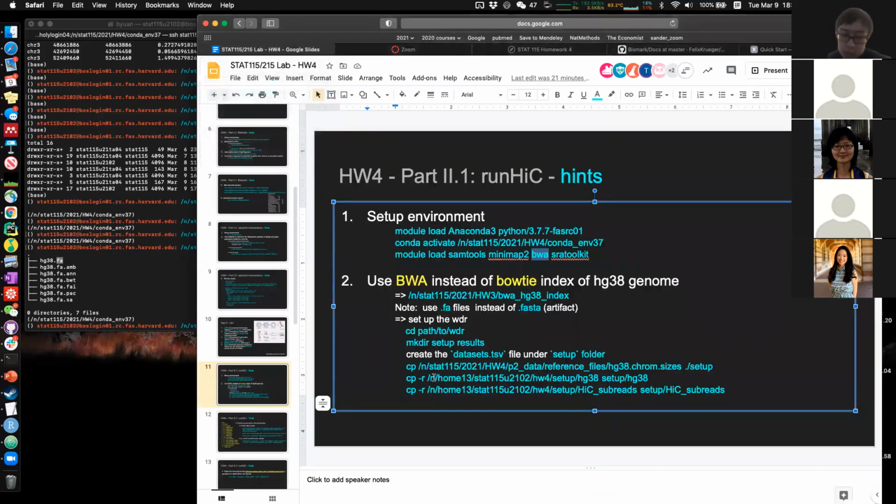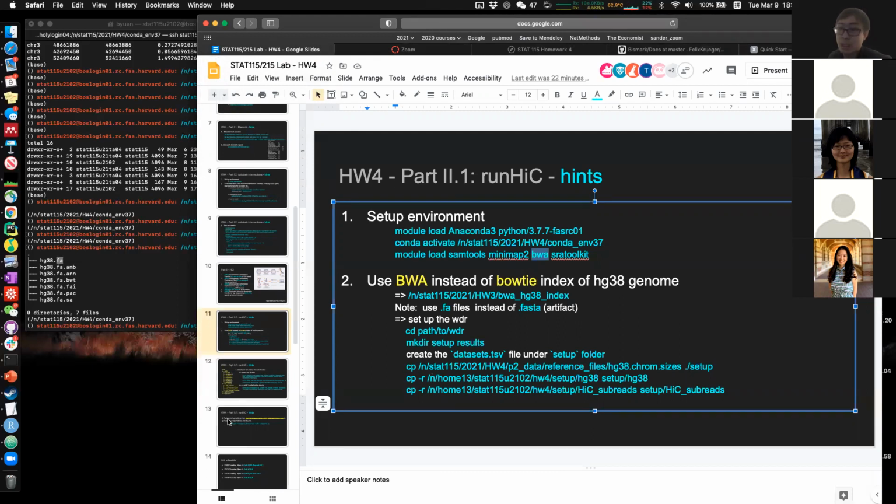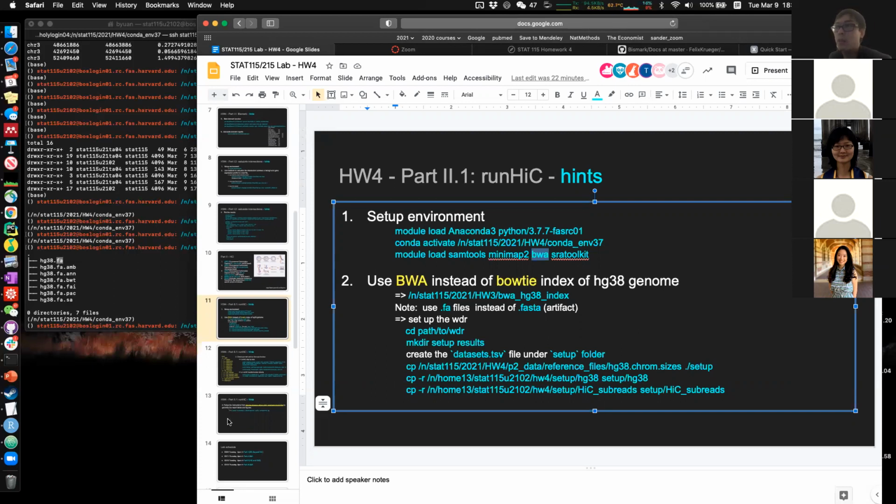some statistical table summaries and also some plots, and you just need to put them into our homework so that we know you succeeded in working with run HiC. And then based on those plots and tables, you can answer the following questions, those biological questions.